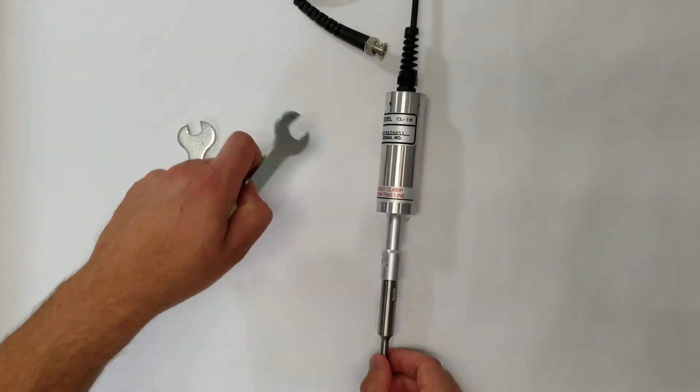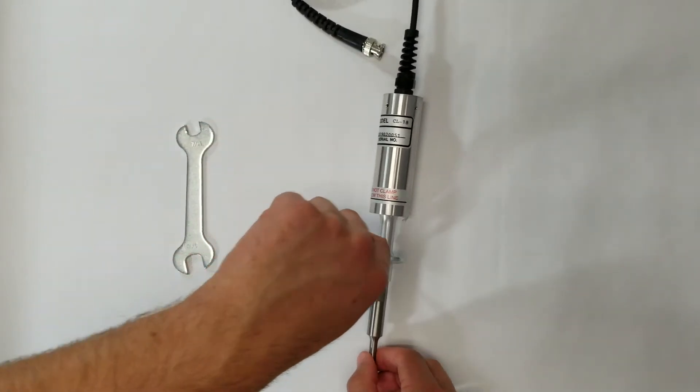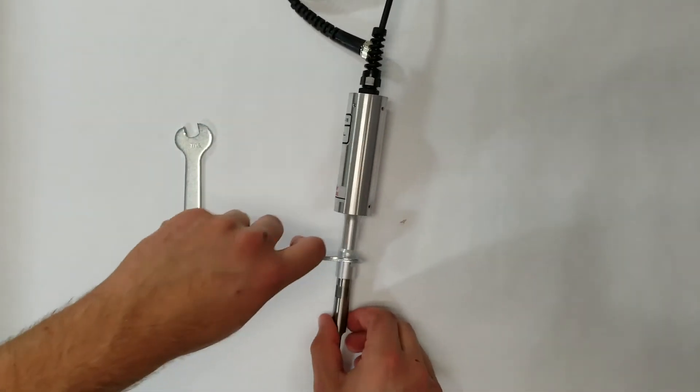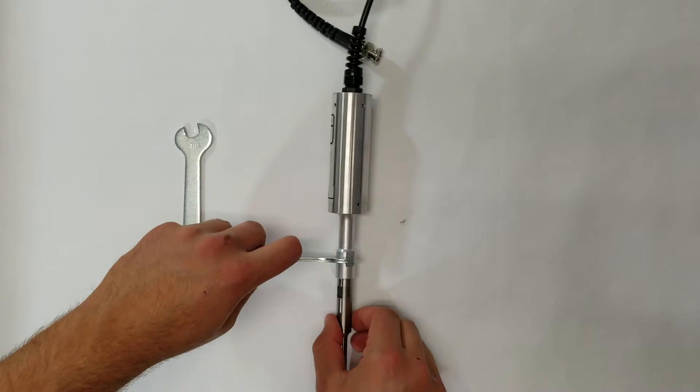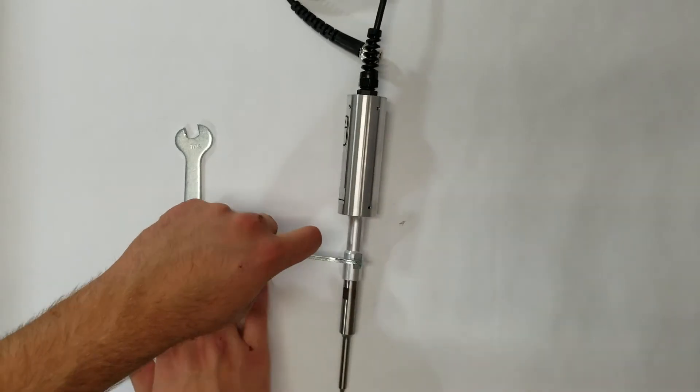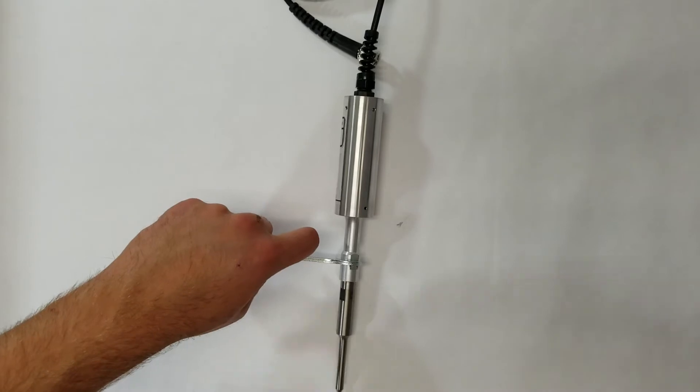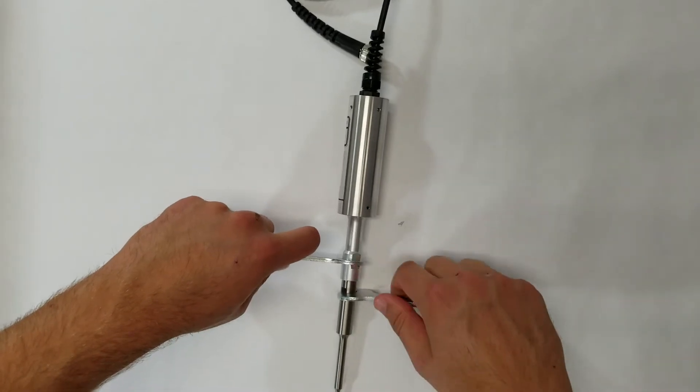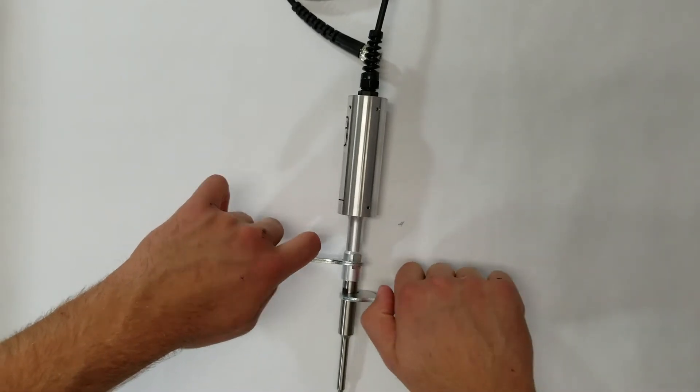Once the probe is hand-tight, place the 9-sixteenths end of the first wrench on the wrench flats of the converter. With the other hand, take the second wrench and place the 7-sixteenths end on the wrench flats of the probe.